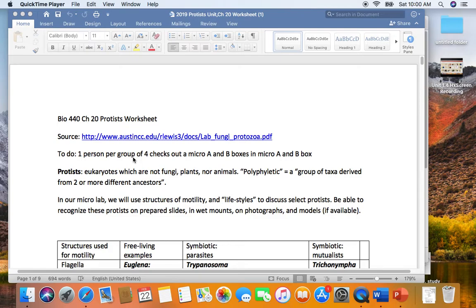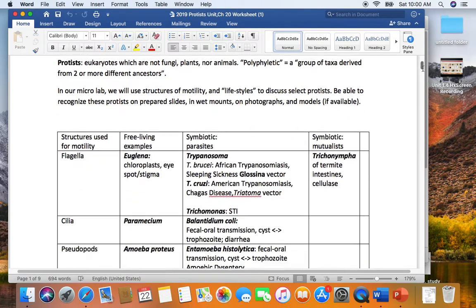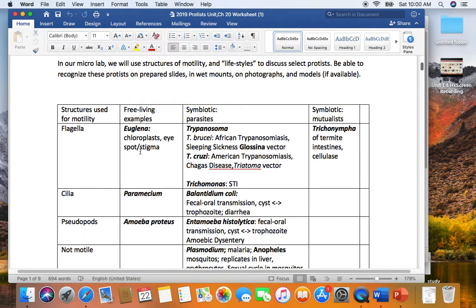So the first video we checked out our free-living protozoa, and those included the flagellate Euglena, the mixotroph, our ciliated Paramecium, and our Amoeba proteus.